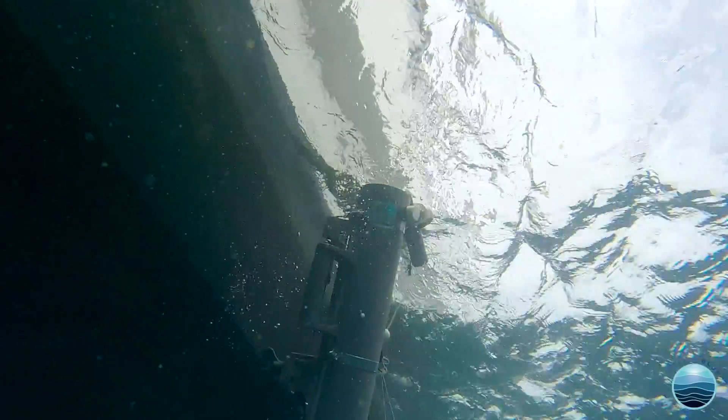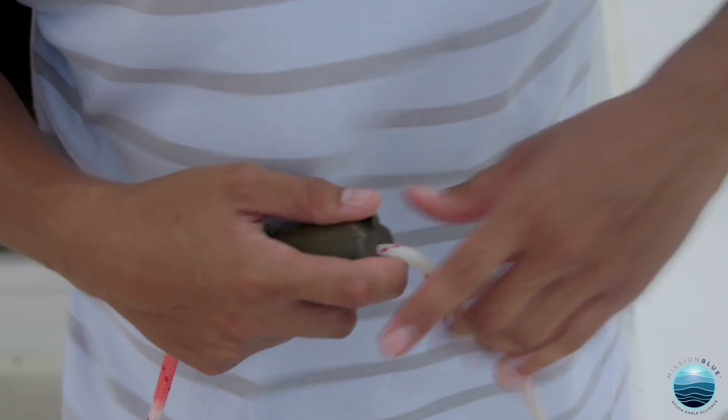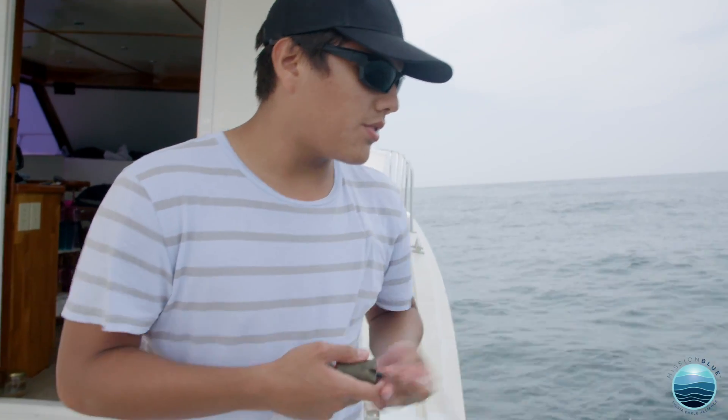Basically, we just throw the bottle, and we have this weight — they're called the messengers. When you send this, the bottle closes at that depth, so you're completely sure that you're getting the sample at the depth that you want.